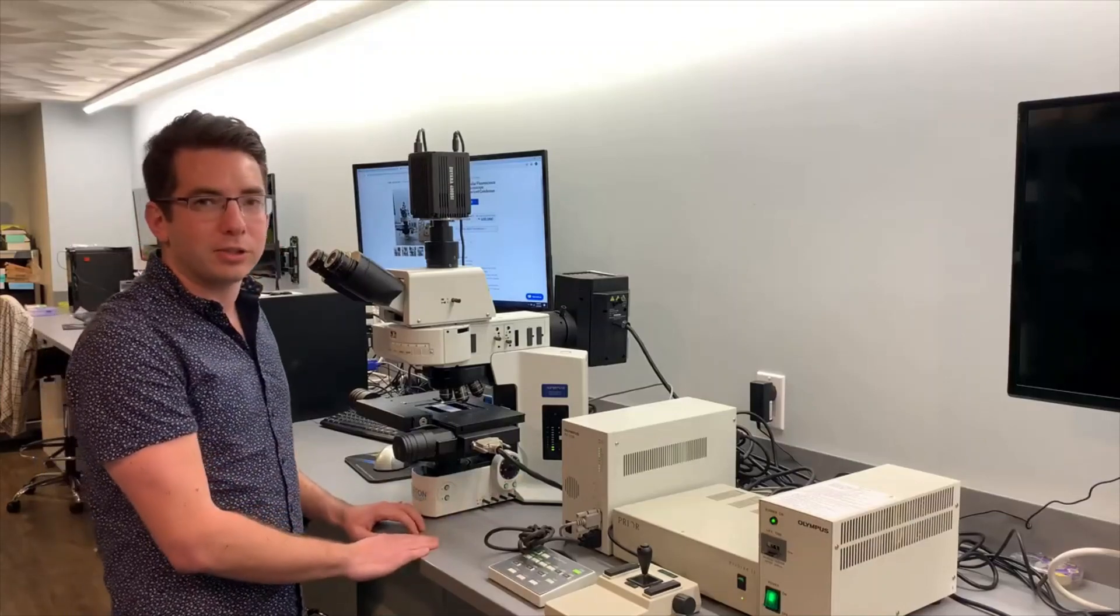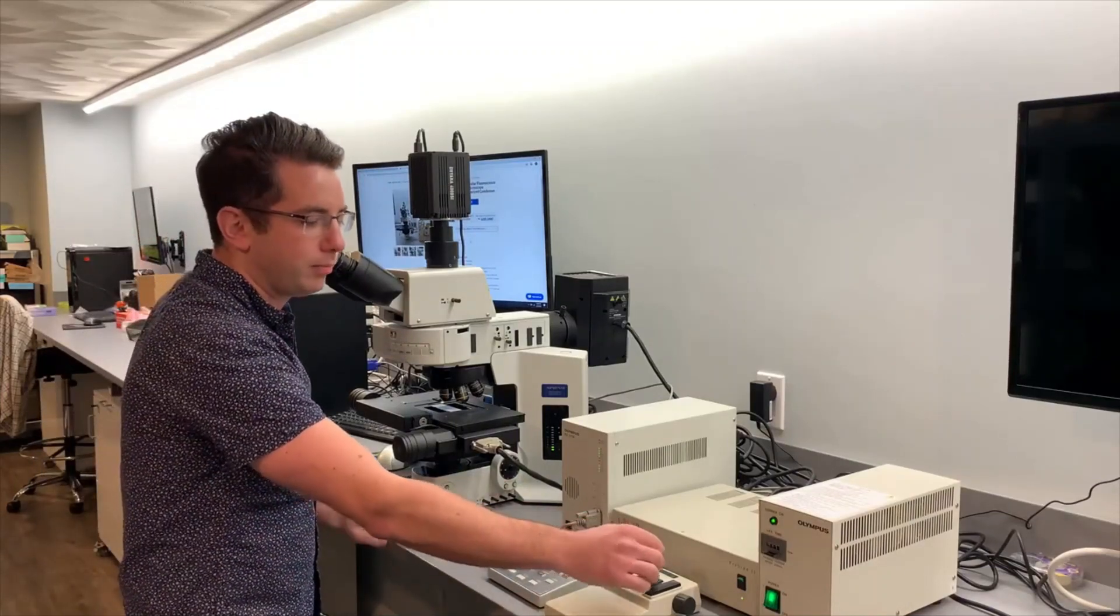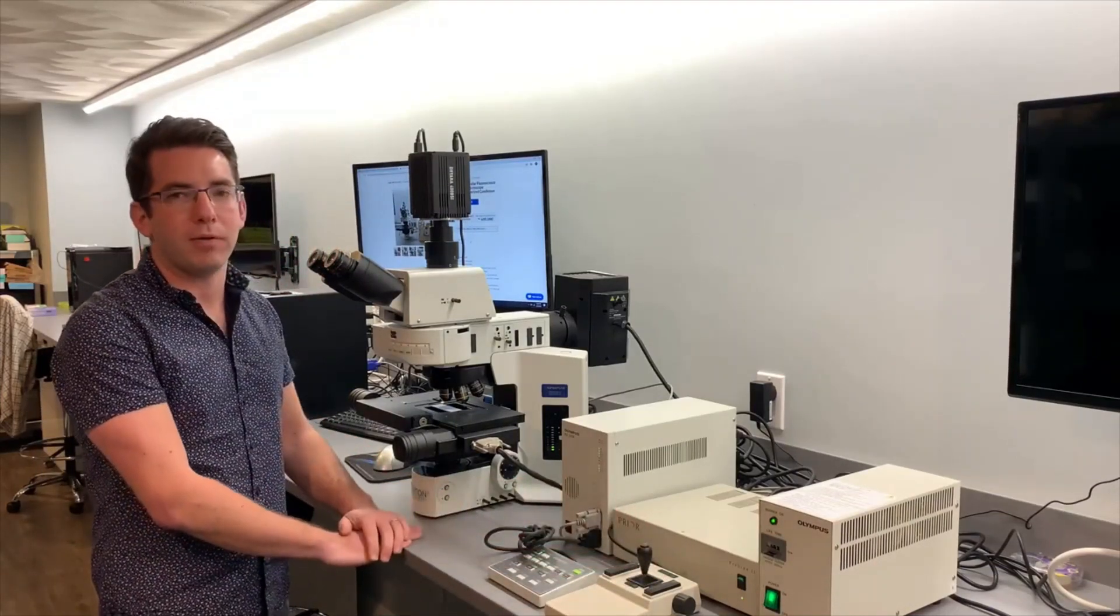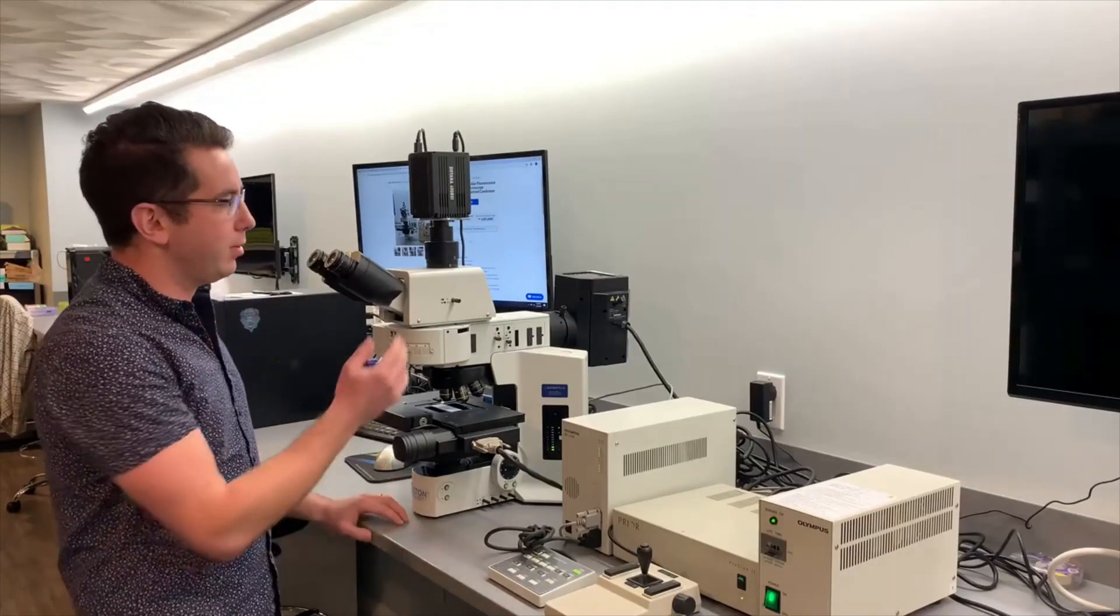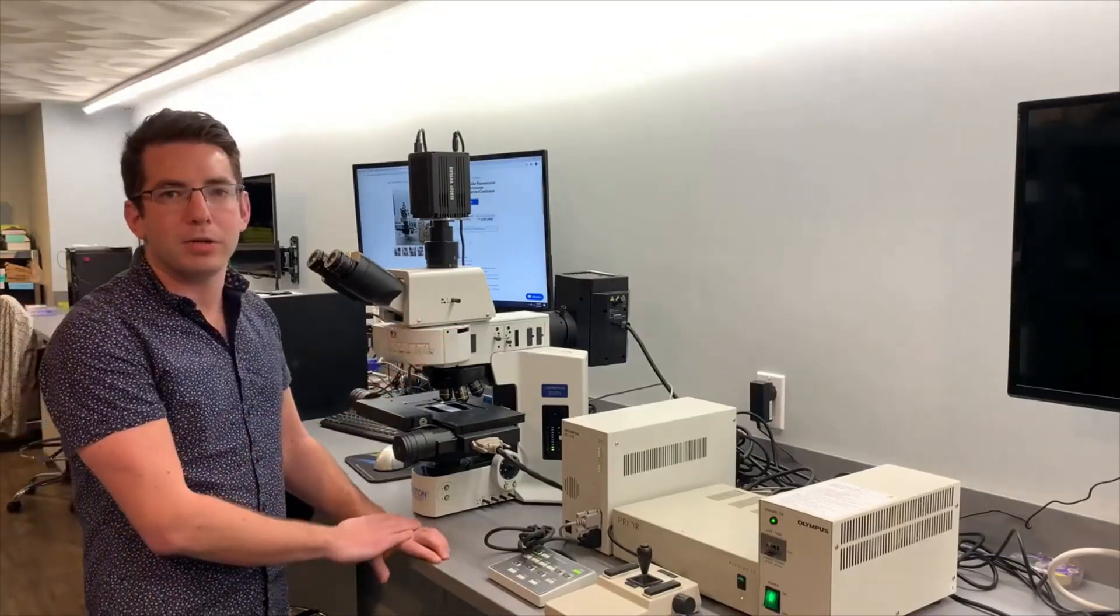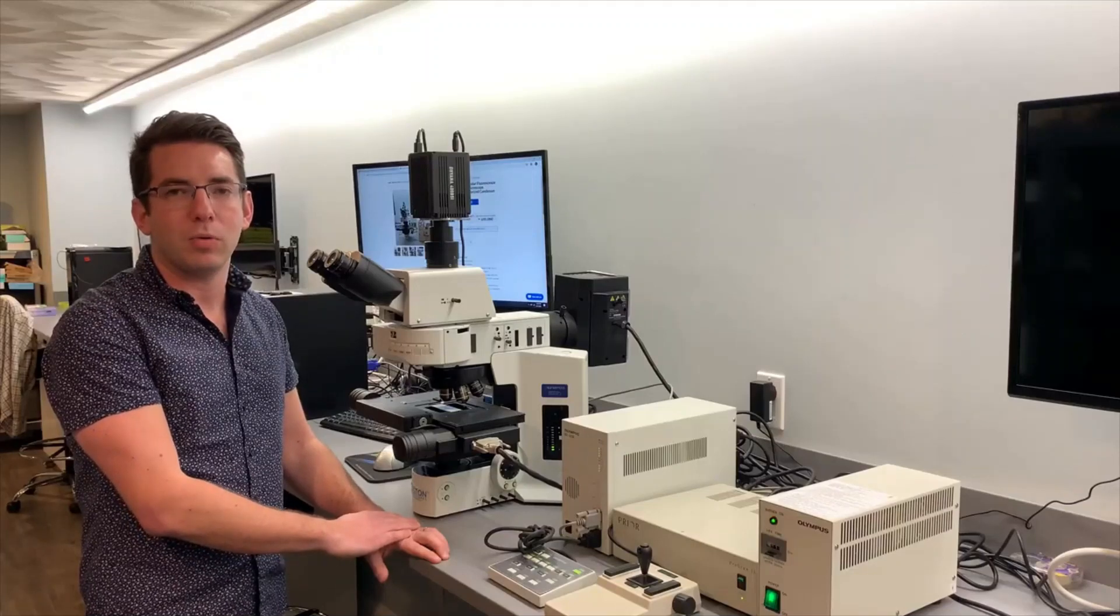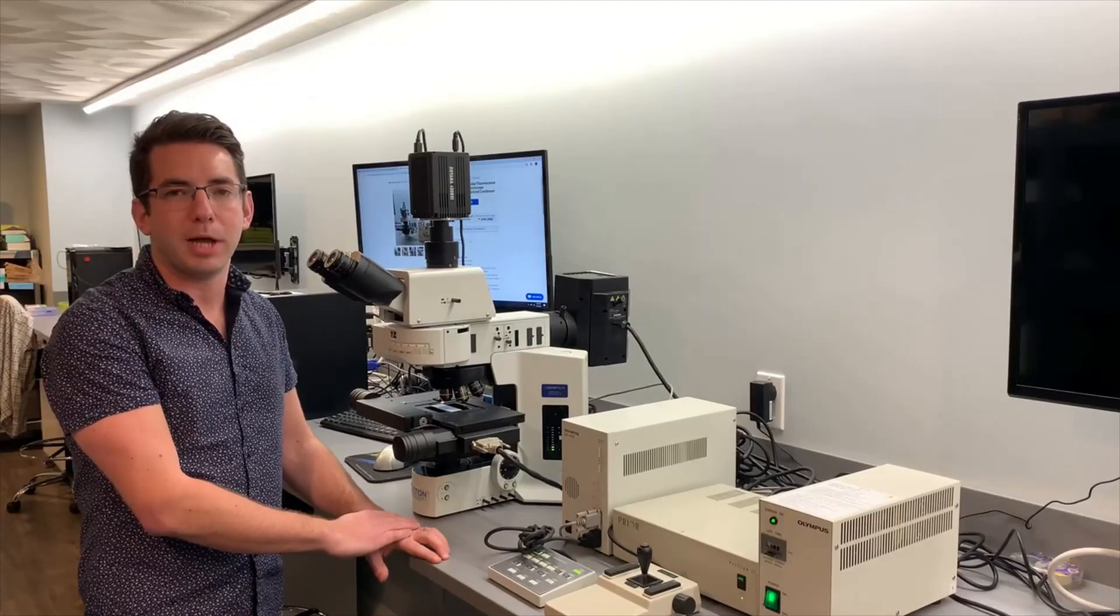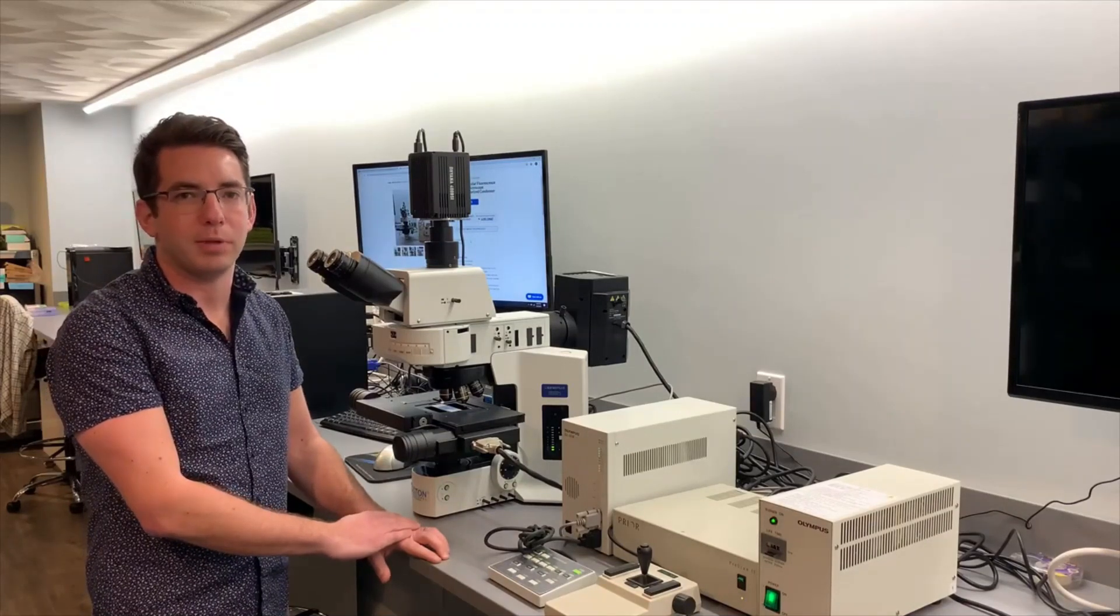The stage can also be controlled manually or through the computer software. This microscope standard comes with a mercury illuminator but can easily be upgraded to an Excelitas or LuminCore LED light supply as well as an 89 North light supply.